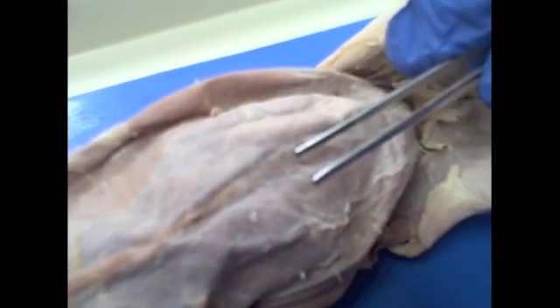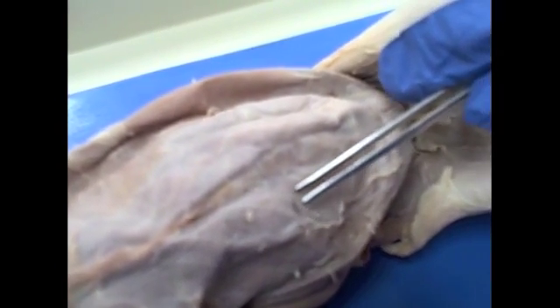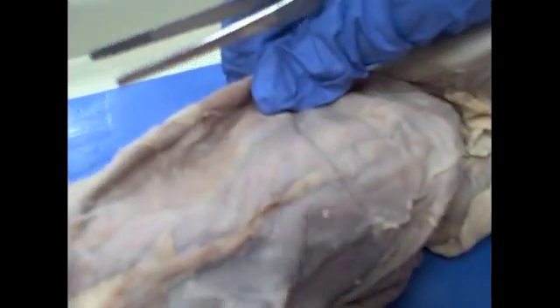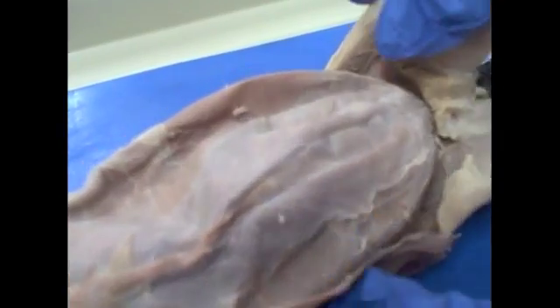On the ventral side is the rectus abdominis, which is on both sides of the linea alba, and it originates from the pubis and inserts on the upper ribs and the sternum. And this works in flexion, while the other muscles work in compressing the abdominal wall.